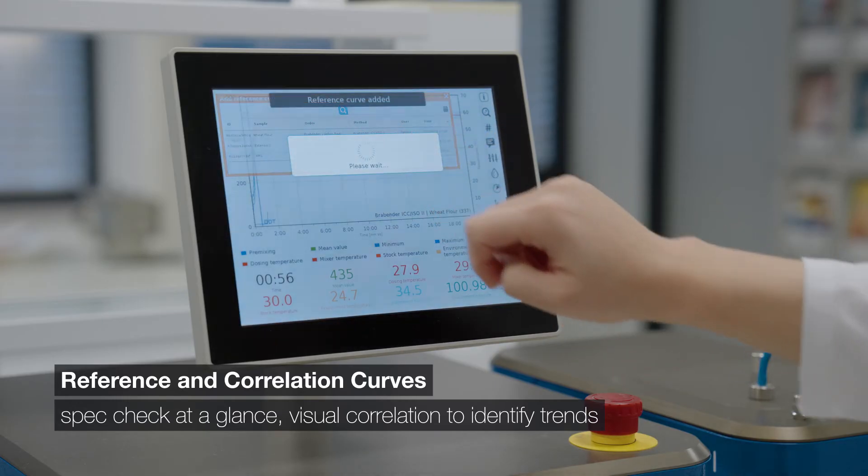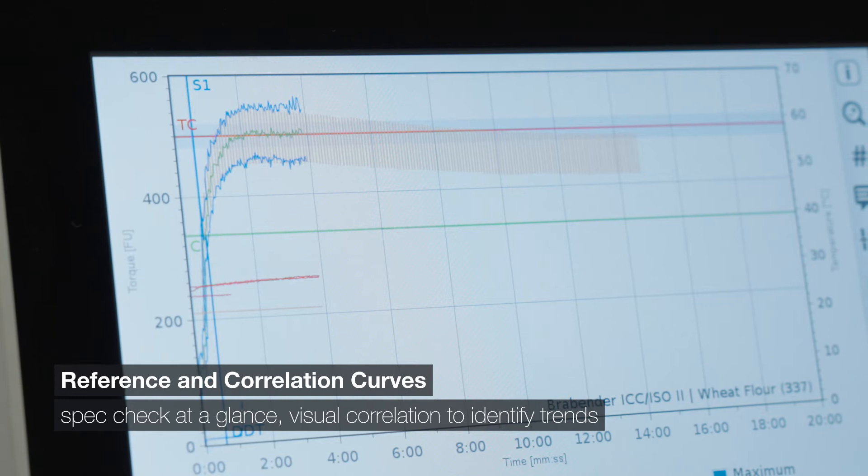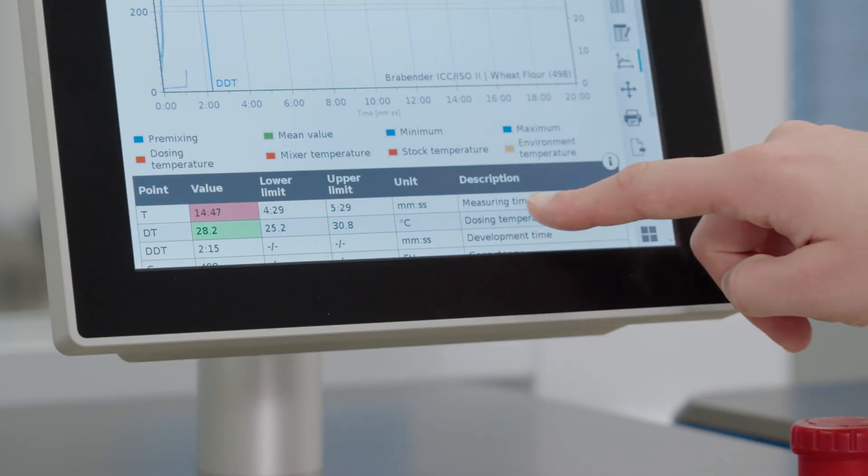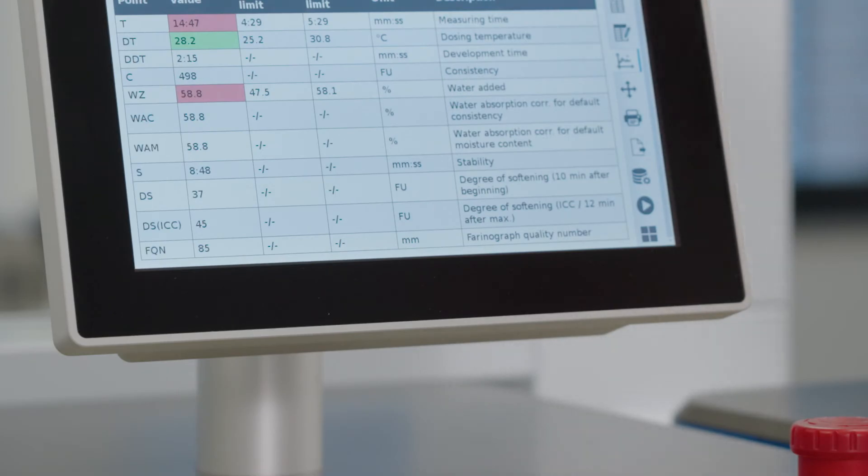Use reference curves for automatic in-spec and out-of-spec evaluations. And for those who want to dig even deeper into dough, the correlation module lets you compare multiple measurements to identify trends and critical deviations.